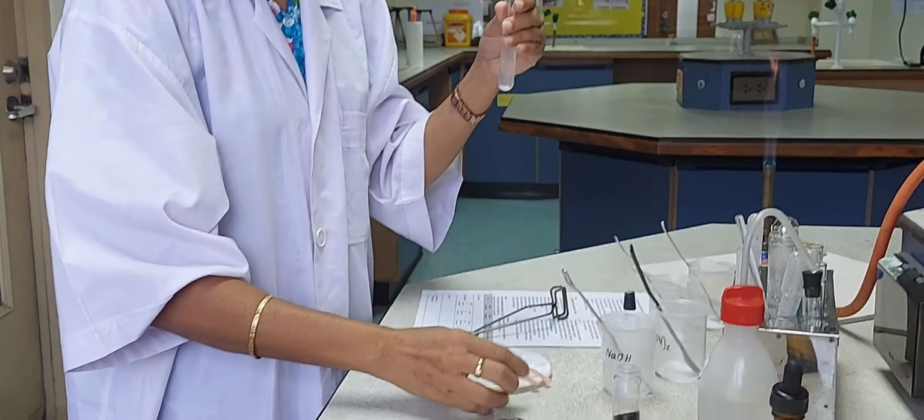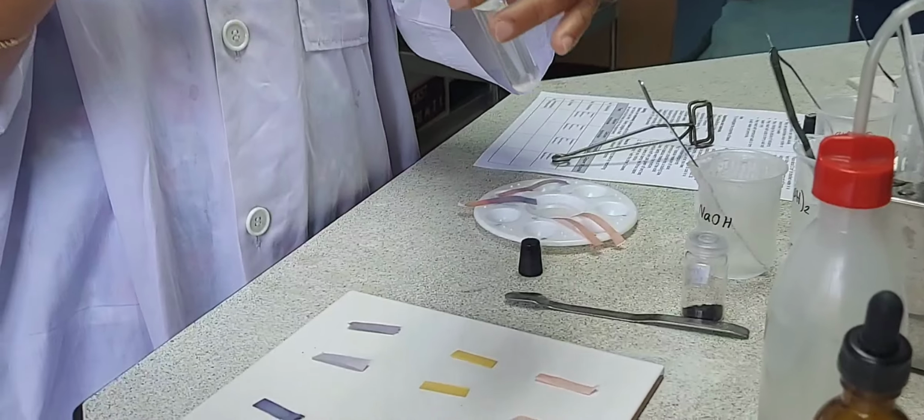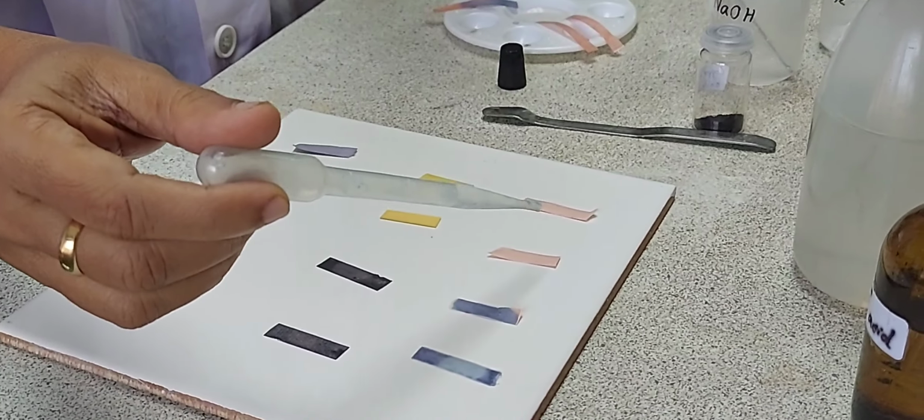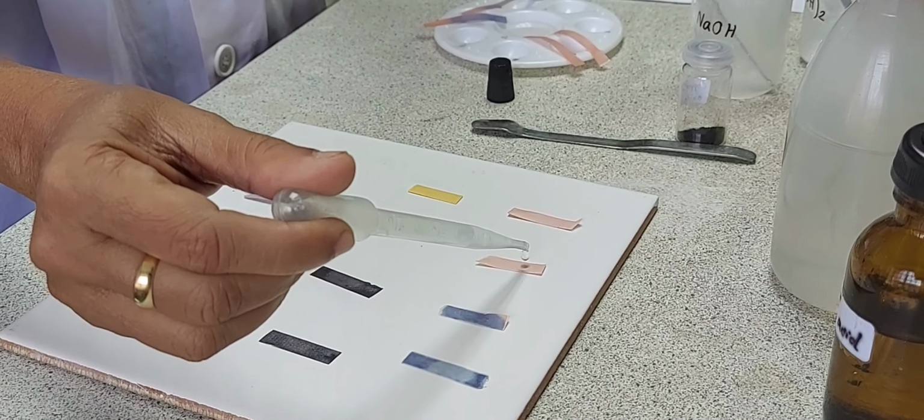So I'm going to take a few drops of barium hydroxide and test its basicity on the litmus paper.